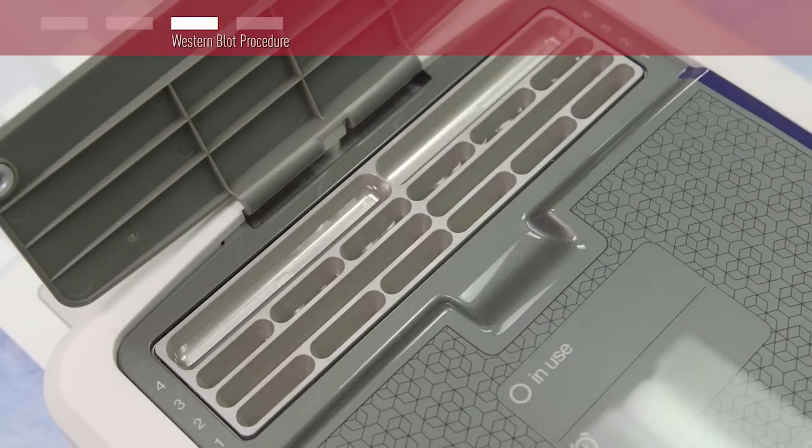Notice that for the mini and multi strip inserts, each column can be loaded with a different antibody pair.